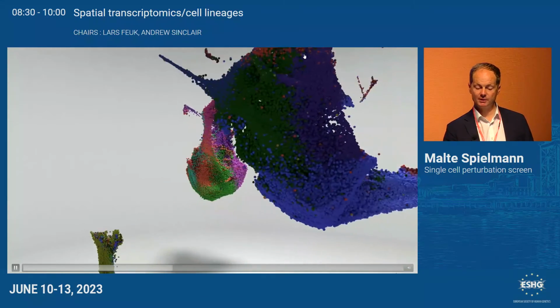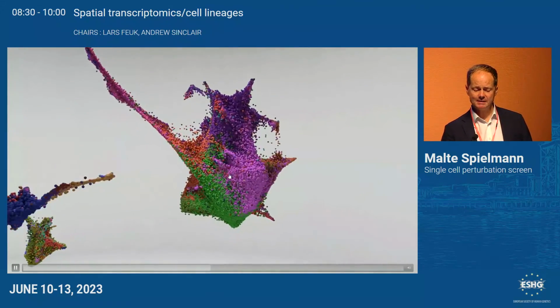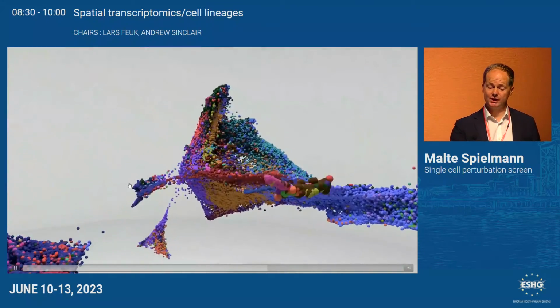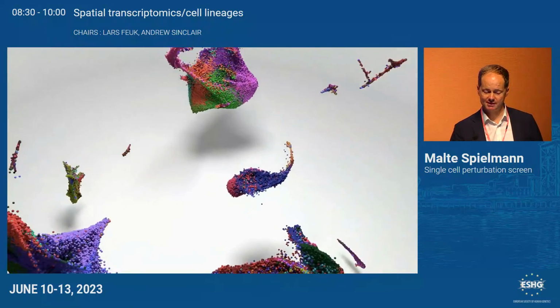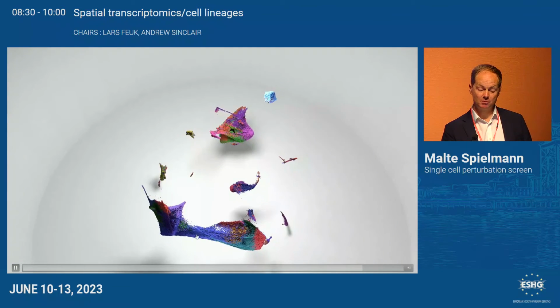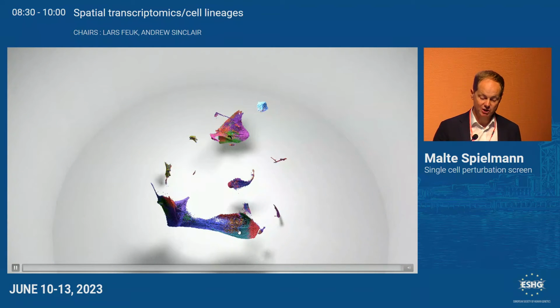And the large fragment here flying by is most parts of the brain. And this tiny part here is my favorite organ, the limb. Looks really boring, right? So this is not only a cool movie, but it really helps to identify new cell types. For example, this is the developing blood. And for example, down here, this intermediate cell type, we couldn't identify before, but now we know that it's part of the brain. That made it much easier.